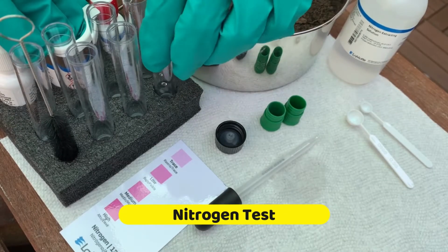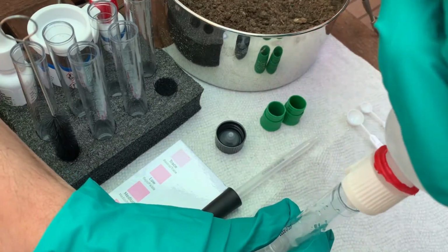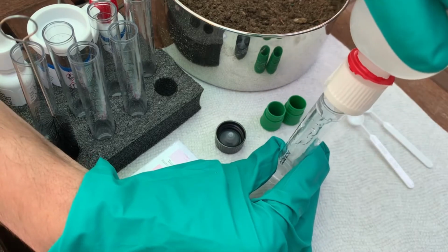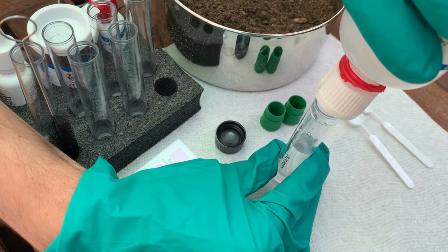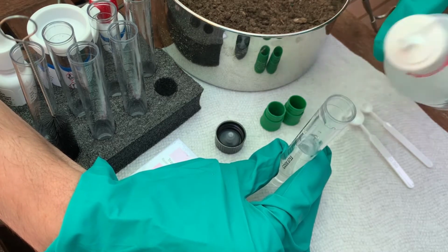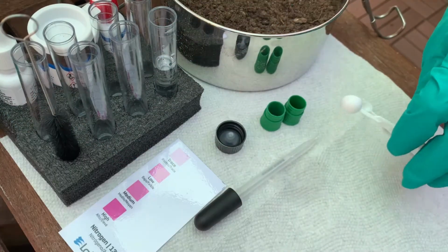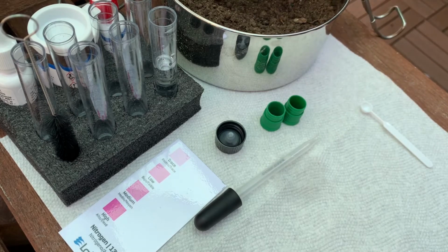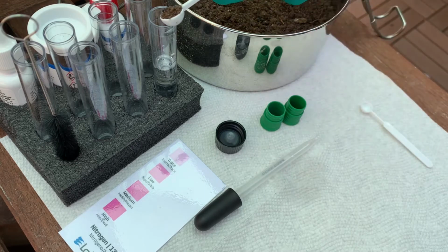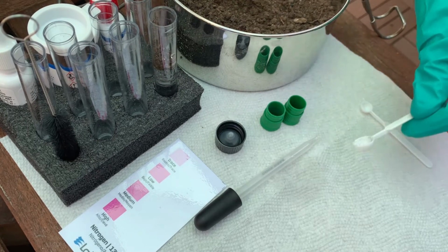So let's begin the nitrogen test. And I'll go through this step by step for you. You want to fill the test tube to line 7 with that nitrogen extracting solution. And technically we always fill to the bottom of the meniscus, although in this case there really isn't too much of a difference. So just get it up to line 7, and notice we use the larger of the two spoons to add 0.5 grams into the test tube. We do that twice, 2 scoops.